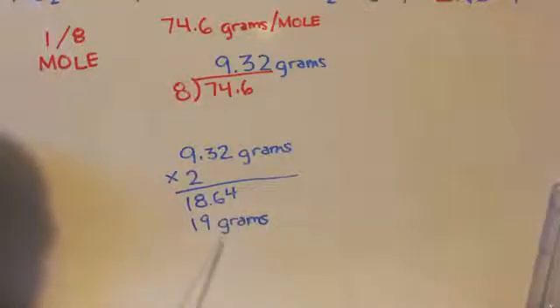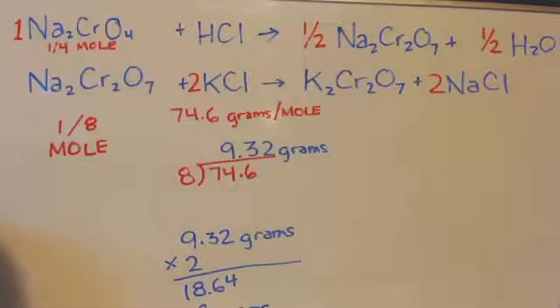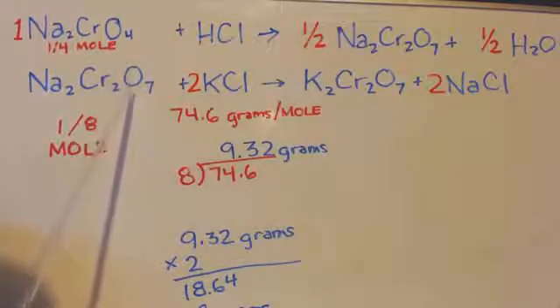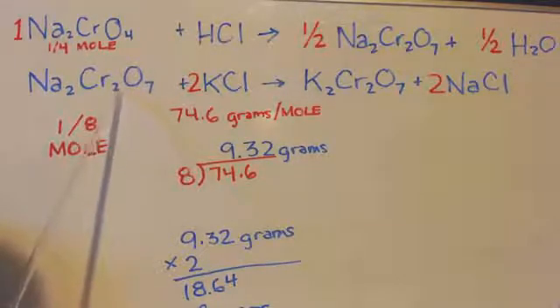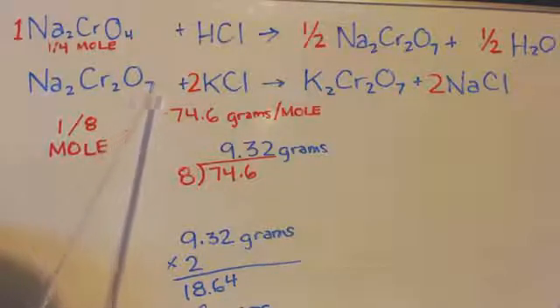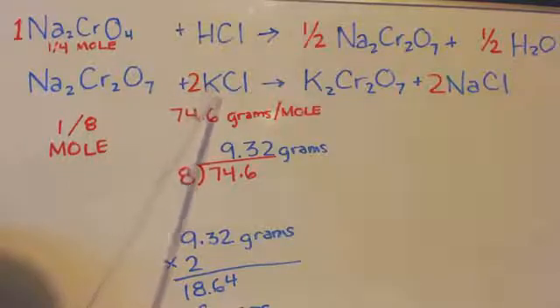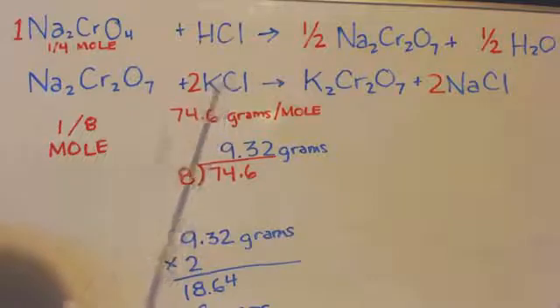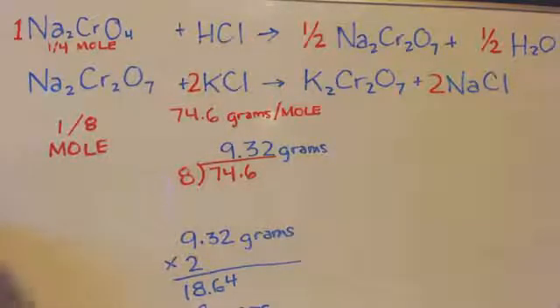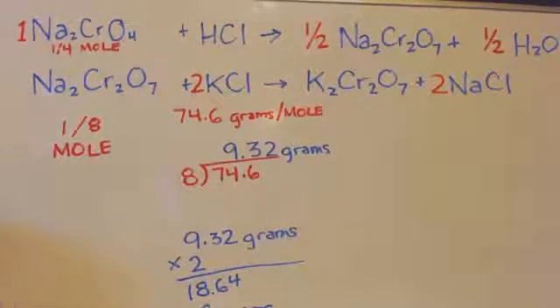But I boiled down the potassium chloride in the water to where it was hot, boiling and concentrated. So anyways, before we add this, we want to make sure that this right here is concentrated. You want to boil all the water out so it's almost precipitant. And then when it's concentrated, add in this potassium chloride. That way when you add this potassium chloride in, you will have a precip almost immediately, at least a little bit. Within a minute or five minutes, you'll have a lot of precip.